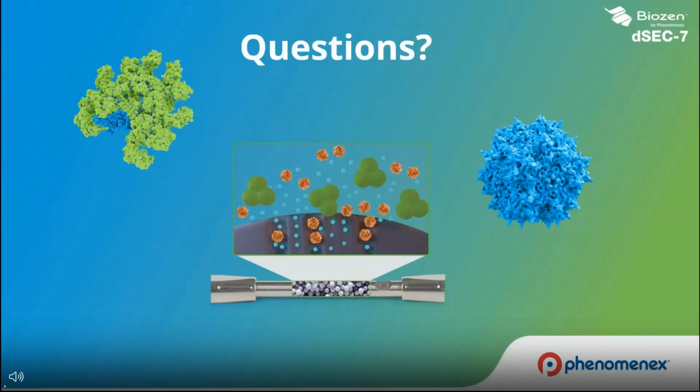In addition to that, I would also say you can save on the sample. You may not need that much sample. You don't need a 400 microliter or 500 microliter sample. It's just a few microliters, 3 to 5 microliter sample injection. And also your run time is going to be really short with your size exclusion, as short as 5 minutes to 7 minutes.